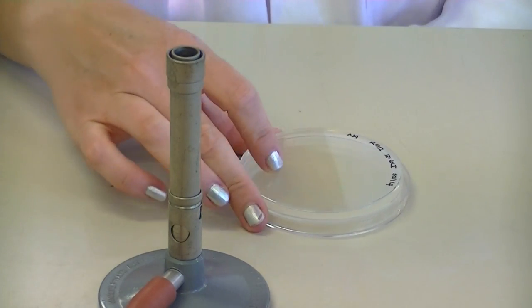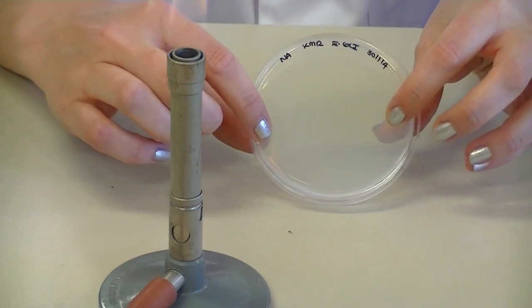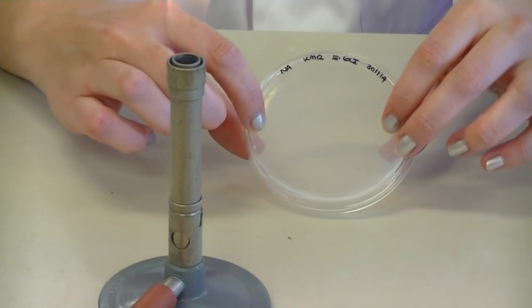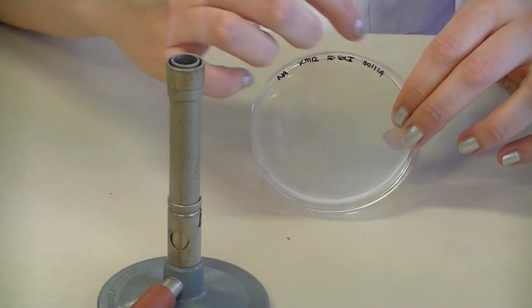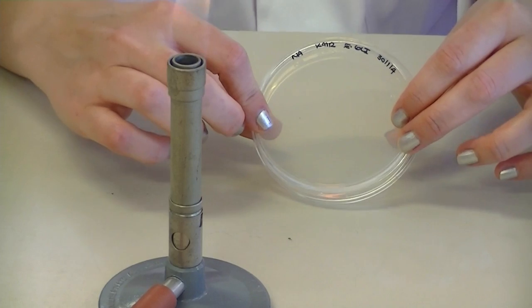You should always label your plate on the bottom of the plate just in case the lid is lost in transit or is removed from the plate. You also need to label it on the edge or the circumference of the plate so it doesn't obstruct the view of what is growing on your plate.